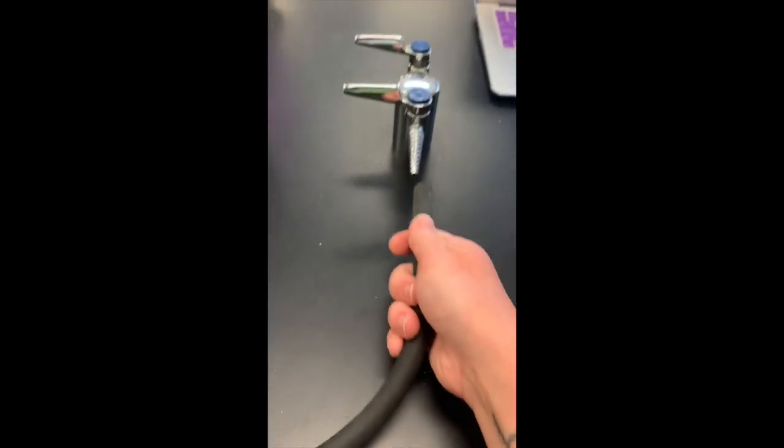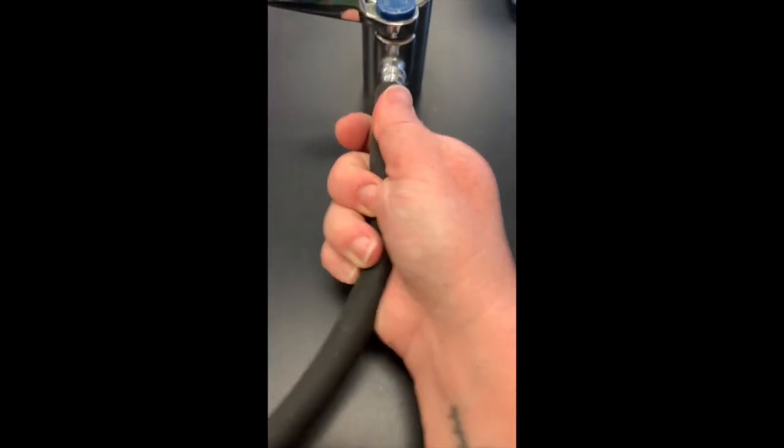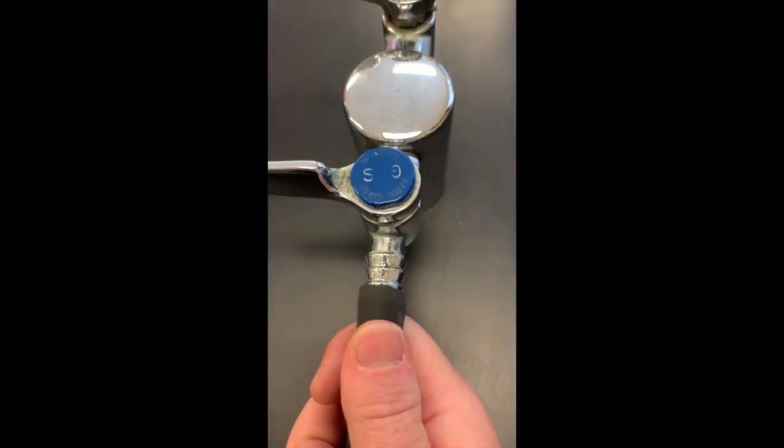First, take the open end of the rubber tubing and push it onto the gas nozzle. You can tell it's gas because it says it. Push it up to about the third notch.